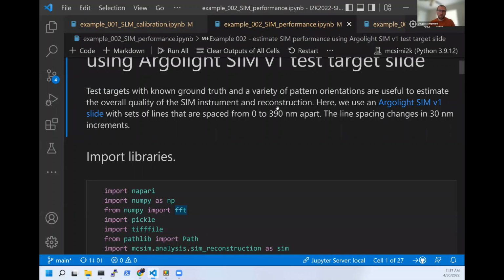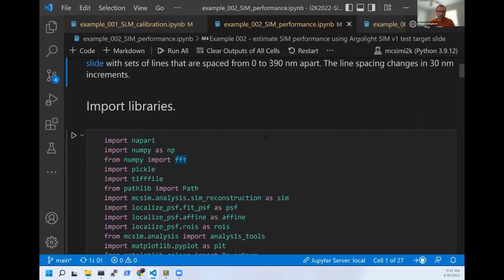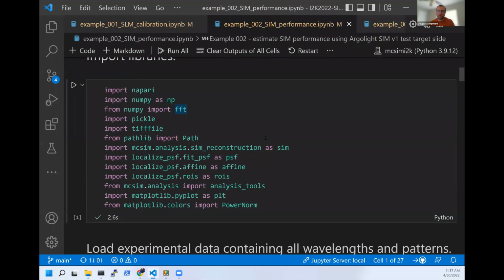If you look at the paper that Peter cited that we published on this instrument in this package, you can see that we provide data from all of them. So again, we have a number of imports here. We have more this time. And I do want to say we do store our affine transformations and our patterns as NumPy pickle files. If you're uncomfortable loading these, that's fine. Please reach out on the GitHub issues, and what we can do is resave those as a Zarr for you and then upload them and give a slightly modified version of the code.